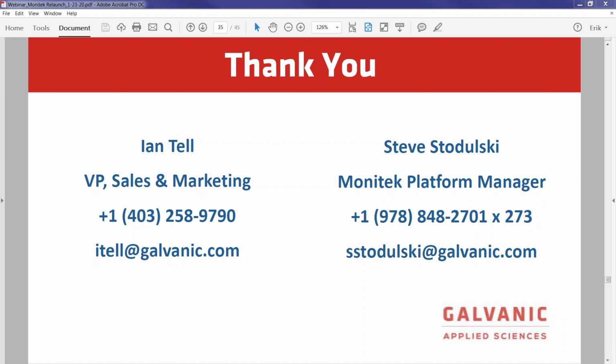Before we close off the presentation, I do want to open this up to questions at this point in time. Does anybody have any questions? Yeah, Ian, we have one that I'll read out for Steve and he can answer it. All right, so we have a question from Rocky. For clarity regarding the color measurement, are there two sources, one for the measurement and one for the reference, that are mounted inside the controller and transmitted via fiber cables?